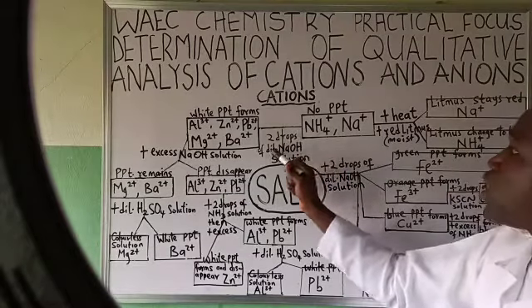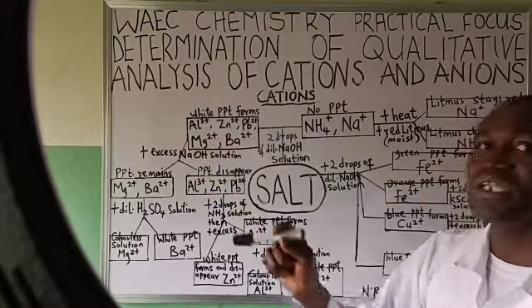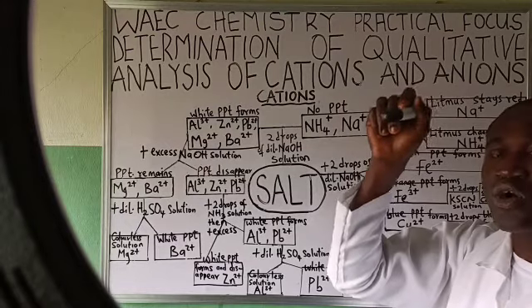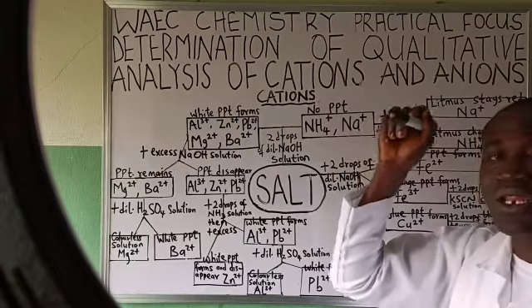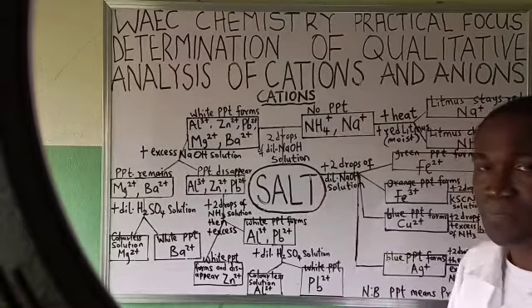Because I put 2 drops of dilute NaOH, and this is giving me white PPT. That is when I will now go and say, and that's my observation, salt contains what? The inference: salt contains insoluble what? Salt likely contains insoluble cations.